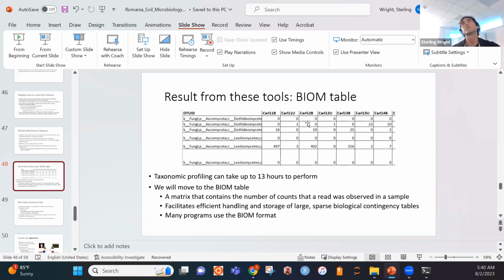This is like class 1, this is a different class. I know it doesn't extend all the way, so it's kind of hard to see that. But this genome may be like 10 gigabytes in size, this one may be just 5 megabytes in size, right? It all depends on how the sequences in this sample are mapping to these references.